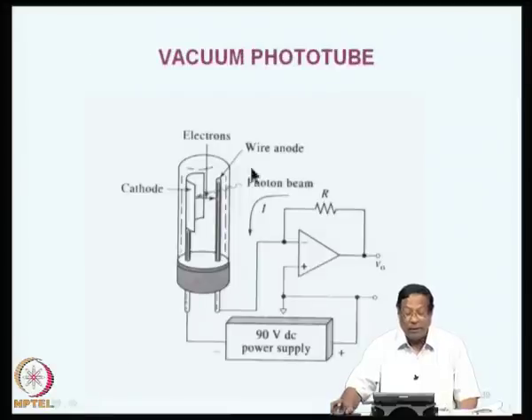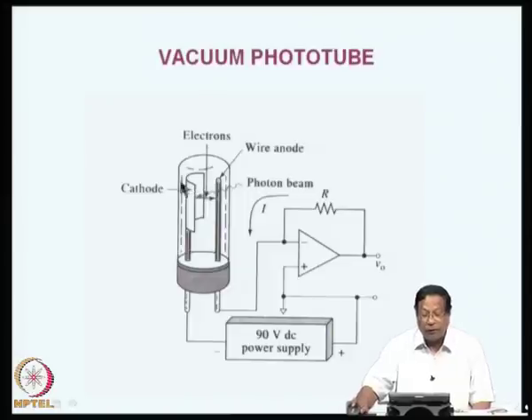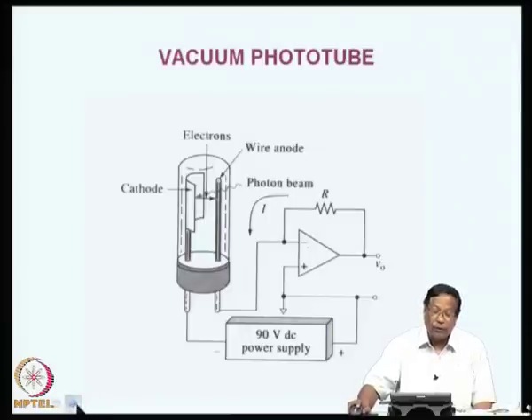Then we have vacuum phototubes or photo emissive tubes, as they are called. Here you can see that there is a cathode here, and a wire anode here. A photon beam falls on that and releases the electrons, and the electrons are collected at the wire anode, and the whole thing is under vacuum. Essentially, the current can be modified and amplified using the 90 volt DC power supply. That means, if the sensitivity is low, you should go for vacuum phototubes.